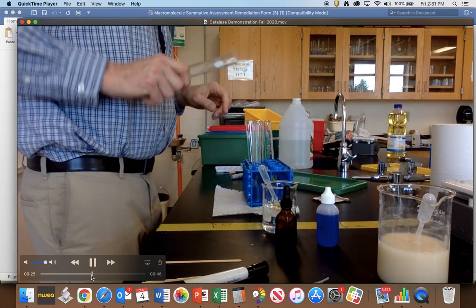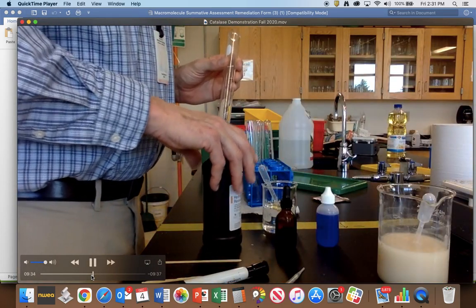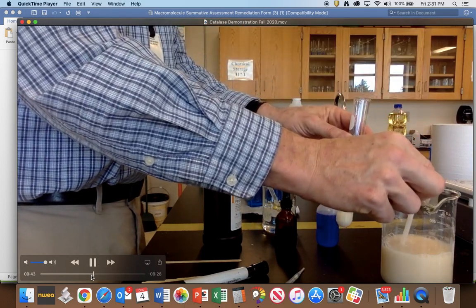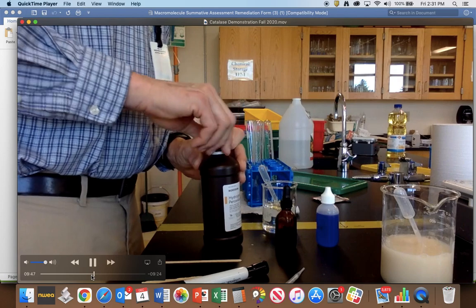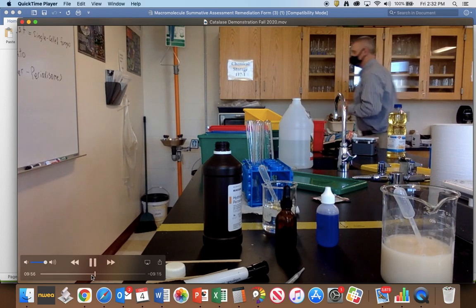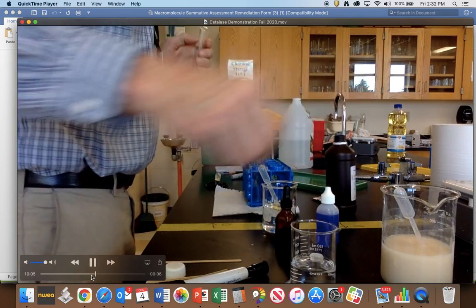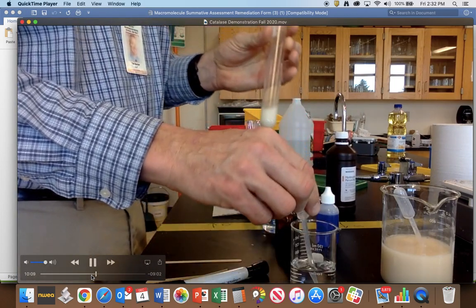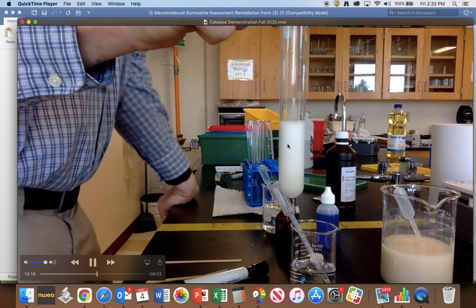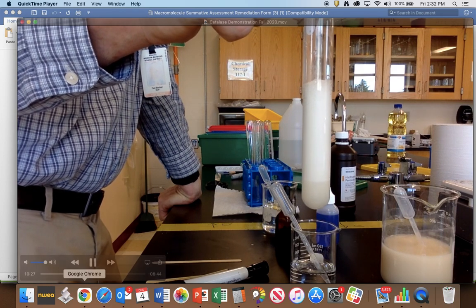All right, here we go. I'm going to take the good yeast. So it has lots of catalase in it. All I did to activate it was put it in a little warm water that morning. Put the hydrogen peroxide in there. I'll add it to the container, and you see the reaction happening. Those bubbles are happening because of the oxygen that's being released from the reaction, and the catalase is breaking down the hydrogen peroxide.